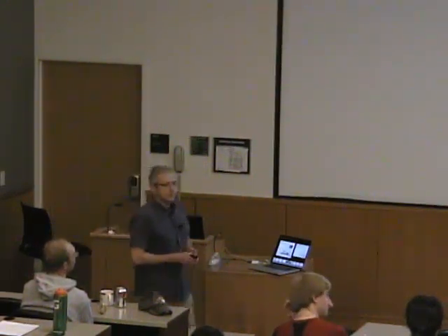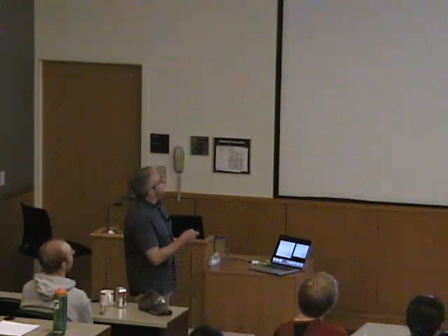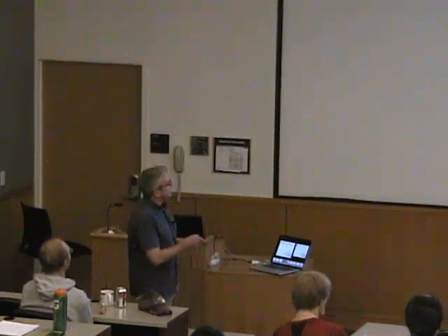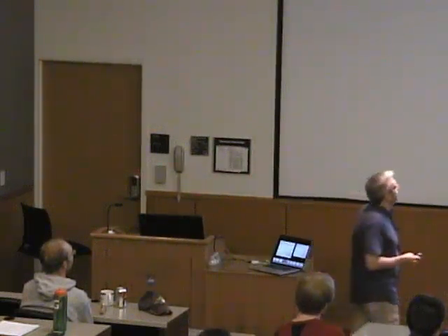Now we can think about what's actually happening with this whole diffraction process, because another gentleman came by, Paul Ewald, and thought of a way to visualize what's really happening with Bragg's law. I'm doing this again in 2 dimensions, so everything I show you as numbers, of course, is vectors in space, but that doesn't make it much more complicated. In 2 dimensions, it's actually very simple.